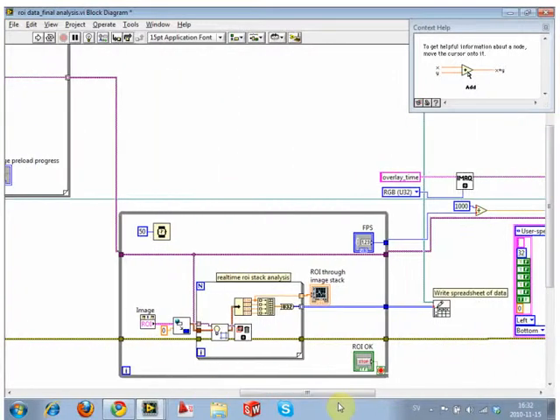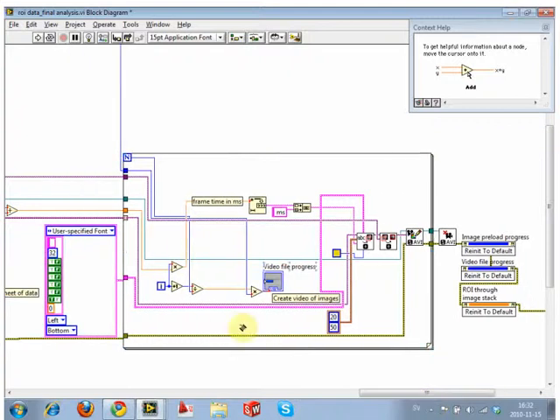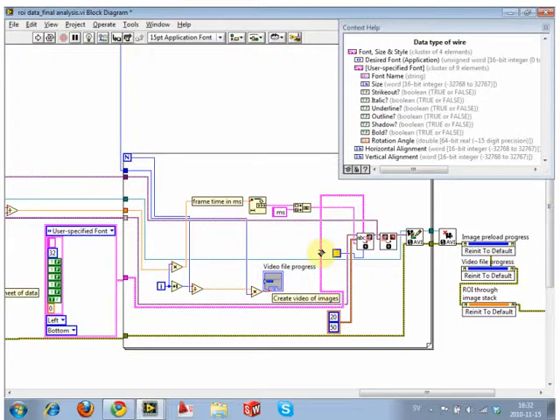Okay. You know, it's kind of like I can have something within one loop where I don't wire anything up, and I can have it show the display and destroy the image at the same level. And it won't know what to do. It just creates a race condition. It's like, does it display the image first, or does it delete the image first? So I can say, display image and destroy memory location for the image at the same level. If I don't wire anything up, then you create what's known as a race condition.